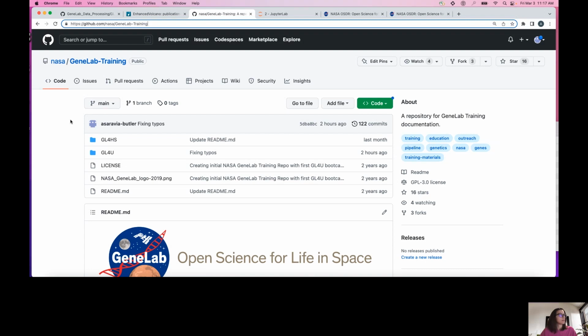Is that the same one we did last year, right? Yeah. Yep. So I added to it. Yep, I'm in. Dr. Lina, are you seeing this too? Okay. Let me just make sure.